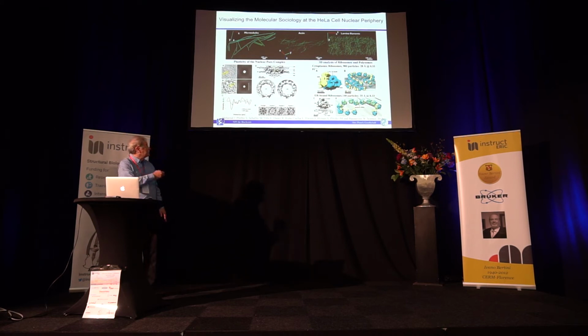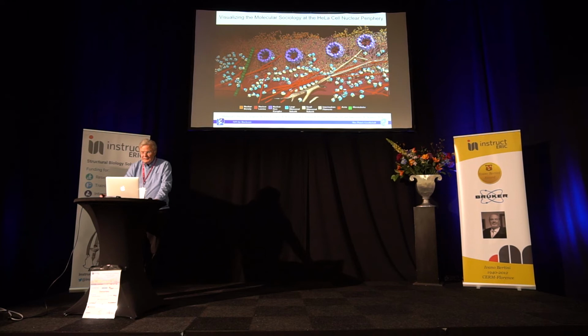So it's also important that we would like to push that to a level where we obtain a structure like this one here, which is only something like 25, 30 angstroms in resolution, not with 5 or 6 copies, but with just a single one. Then, ribosomes are always the objects that you can deal with most easily. They are large, they have high contrast, about twice the contrast of a protein, and they are very abundant. And this is on the surface here, we have these polysomes we have seen in much higher resolution before. So this image puts together as a kind of synopsis all the data I have shown on the previous one. So this is what we call visualizing the molecular sociology of a volume of the cell.